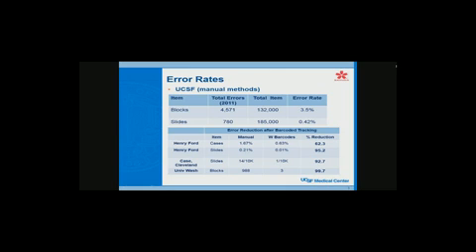This has really been one of the big issues over the years, how manual methods lead to pretty high error rates. I'm showing a slide now that shows what we calculated at UCSF using all our manual methods, which was entering blocks on a standalone printer, and then slides were handwritten, and the labels were applied later. The labels were printed from our system, but they were applied later to the slides. And so these are the types of error rates that we were seeing.